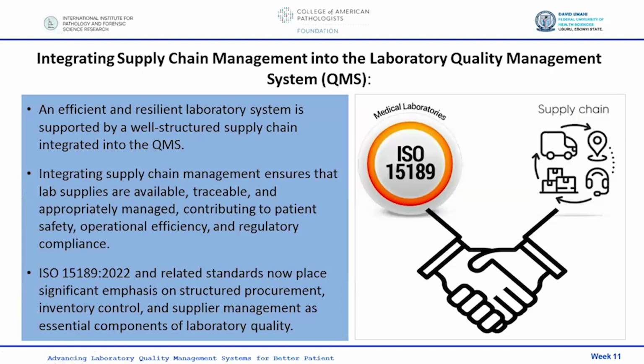Okay, let's look at integrating supply chain management into the laboratory quality management system. An efficient laboratory system is supported by a well-structured supply chain integrated into the quality management system. Integrating supply chain management would ensure that lab supplies are, number one, available, you can trace them, they can be managed appropriately, and they can contribute to patient safety. All these contribute to patient safety, operational efficiency, and regulatory compliance.